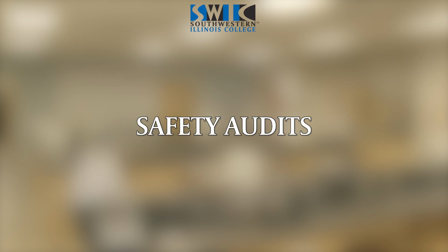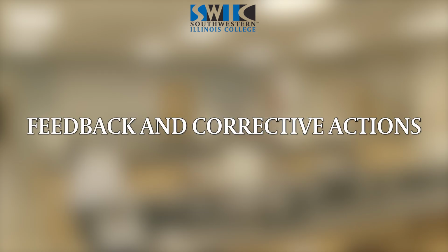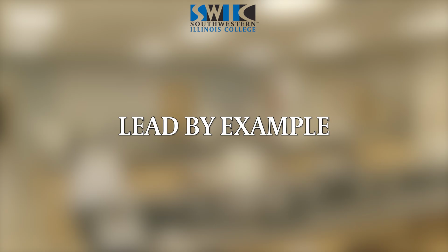Perform regular safety audits. Periodically review lab procedures and safety records to identify areas that need improvement or additional training. Provide feedback and corrective actions as needed. If a student is not following safety protocols, address the issue promptly to prevent recurring incidents. Remember, you are the role model. Lead by example. Make sure you're following all safety procedures and wearing appropriate PPE.